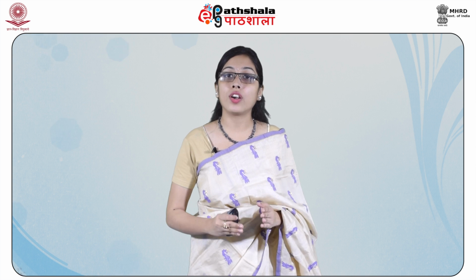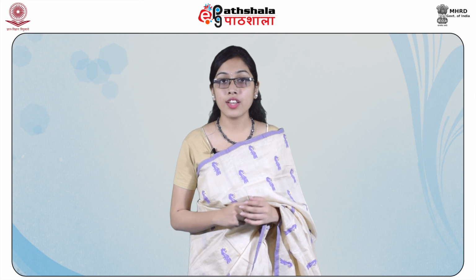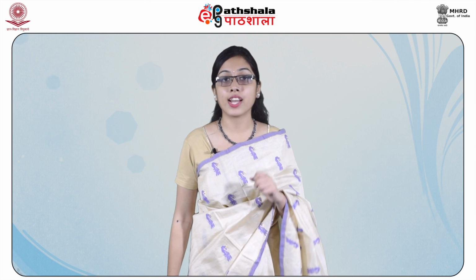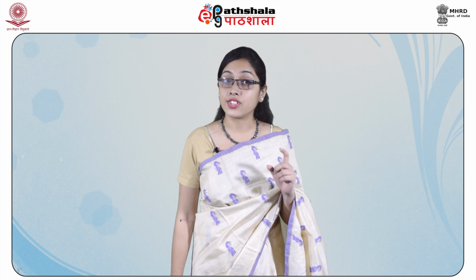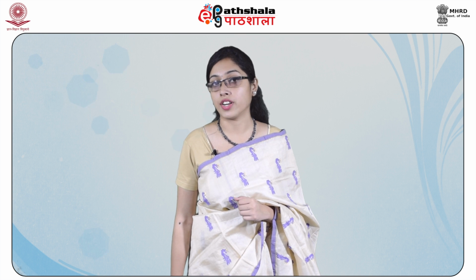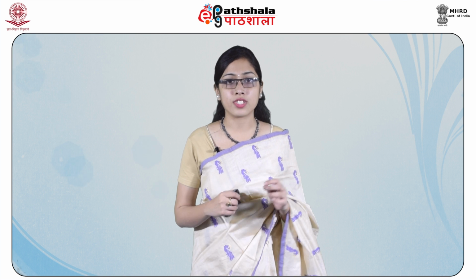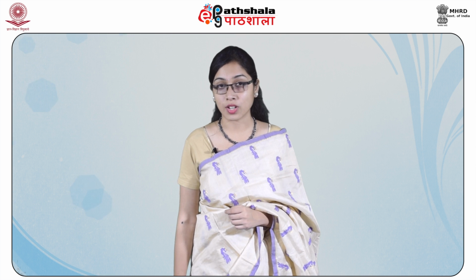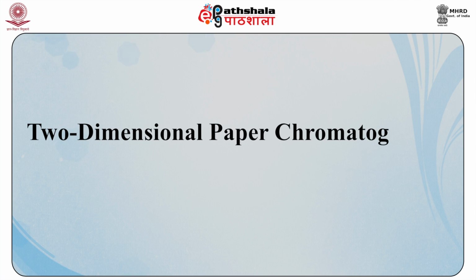Next is radial paper chromatography. It is also called circular chromatography. Here a circular filter paper is taken and the sample is applied at the center of the paper. After drying the spot on the filter paper, it is tied horizontally on a shallow chamber containing the solvent. A wick of the paper is dipped inside the solvent. The solvent rises through the wick and the components get separated in the form of concentric circular zones.